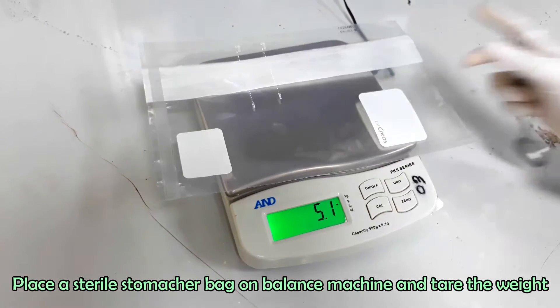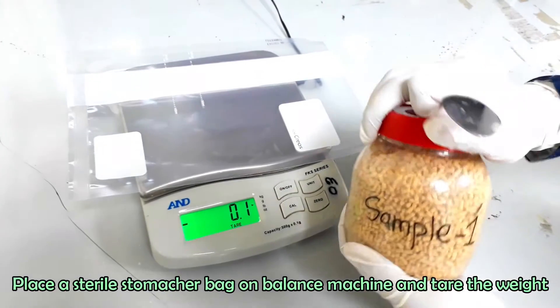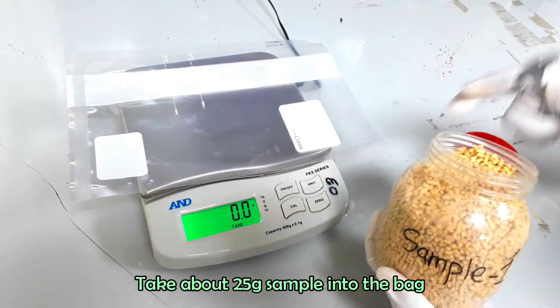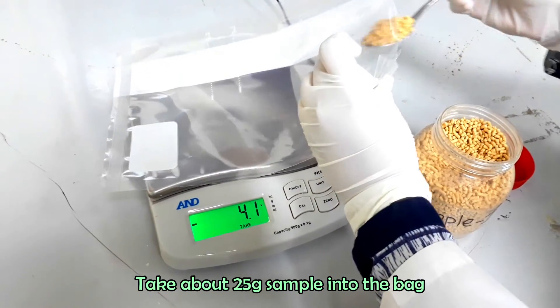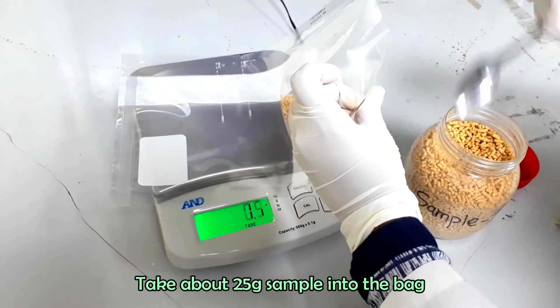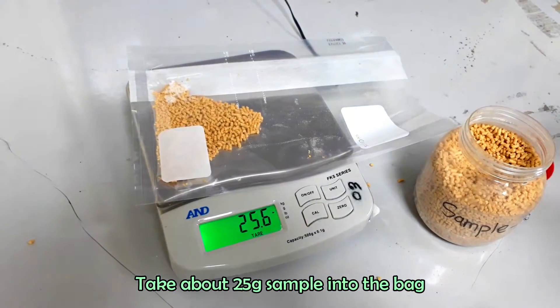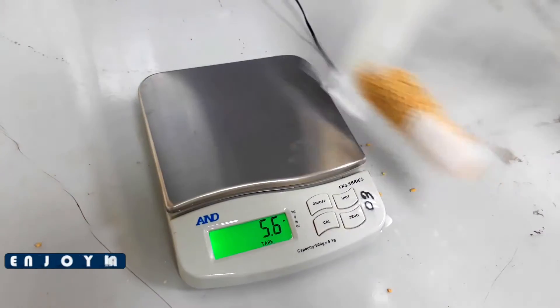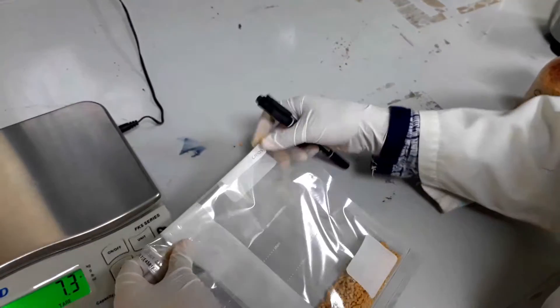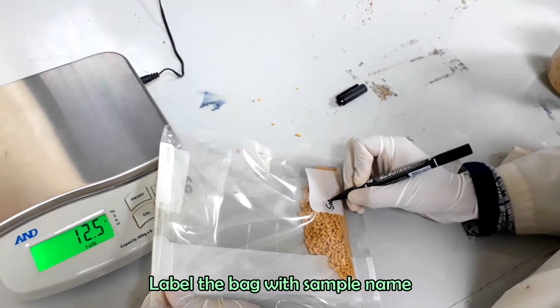Now we will prepare our sample. Take 25 grams of sample in a sterile stomacher bag. Label the bag with the sample name.